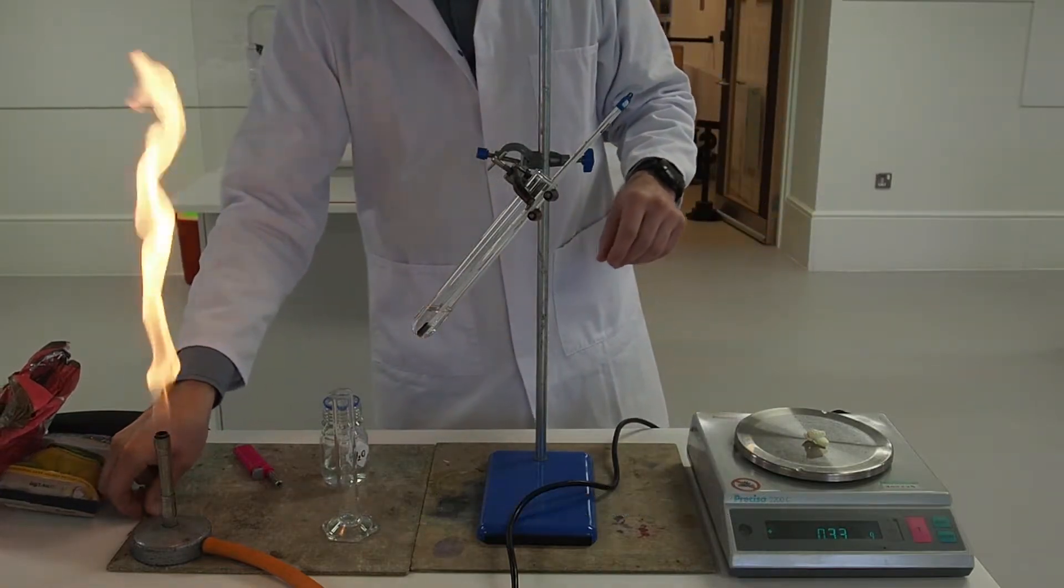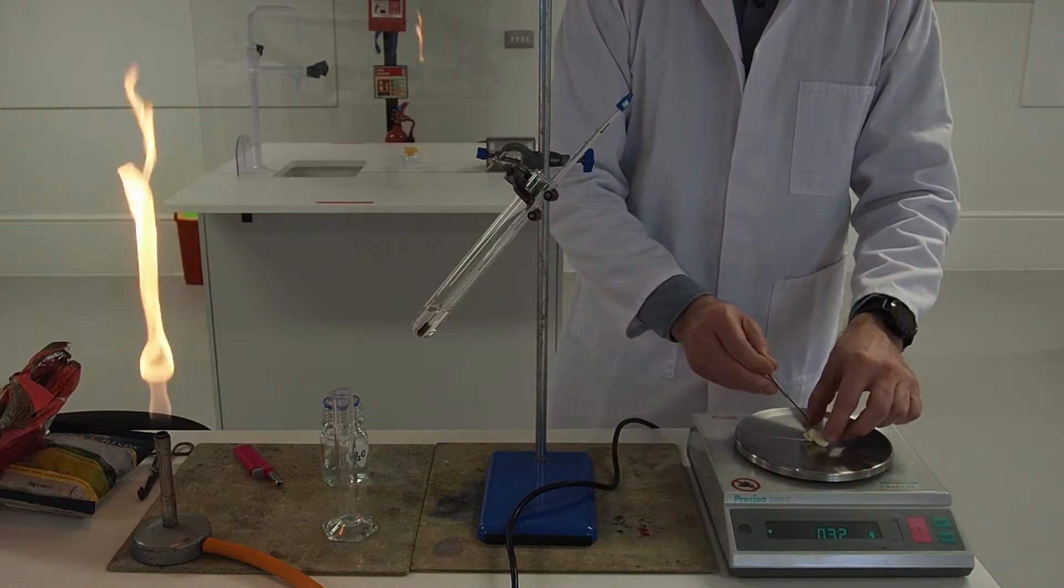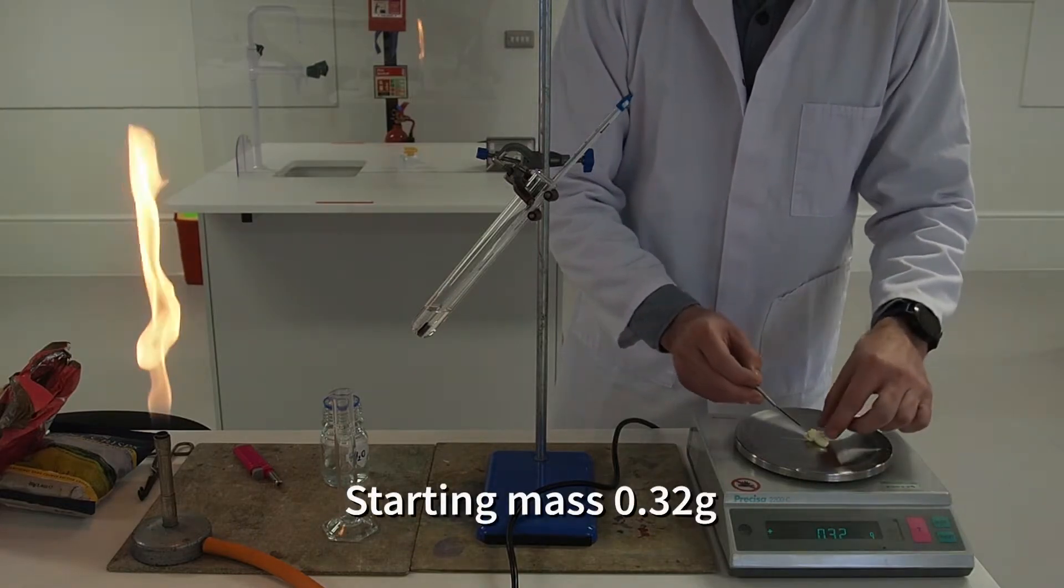Next a piece of food of known mass is attached to the end of the pin or perhaps held in a pair of tongs. Here the starting mass is 0.32 grams.